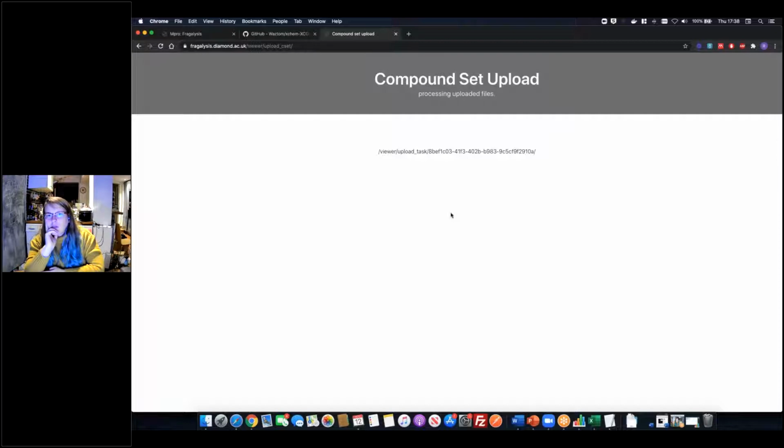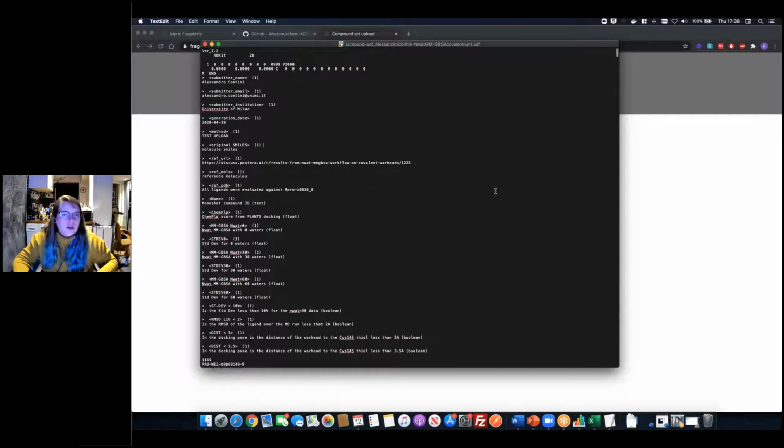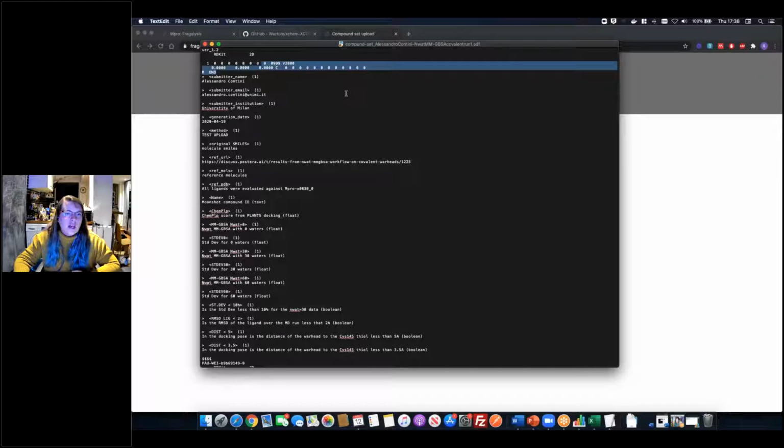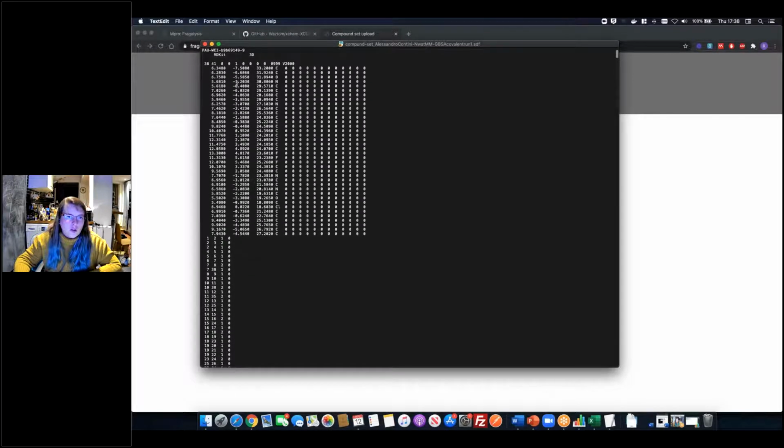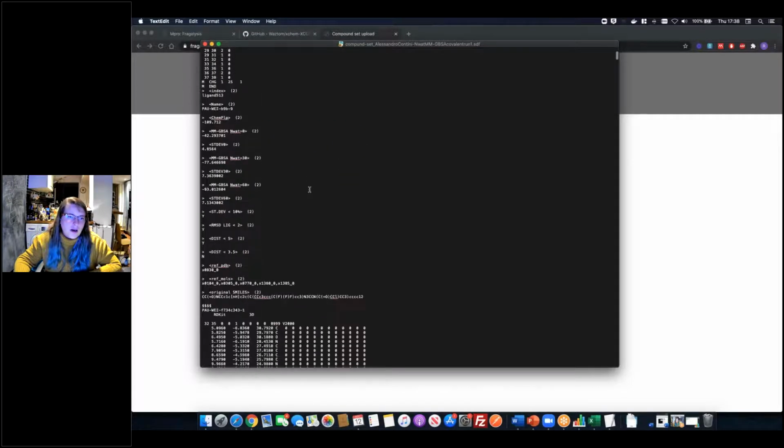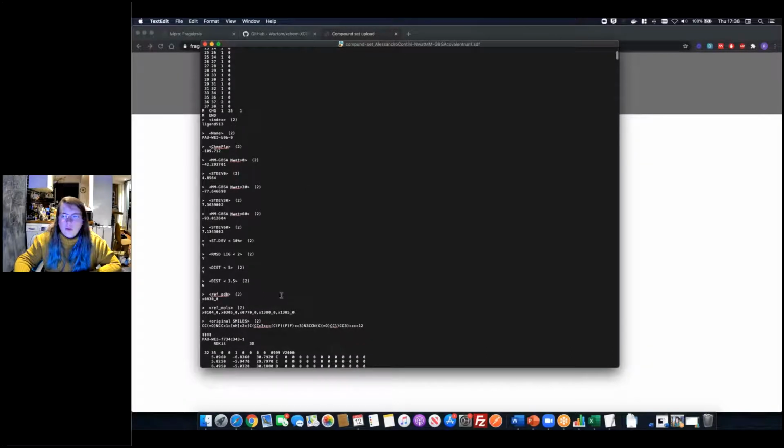Are there any more questions while this upload's happening, Chris? No, but I noticed the file you're uploading is a 2D file, is that correct? No, it's 3D. So that first, I can go through it. So the first molecule is just a blank molecule. So I think this has just been generated in RDKit by the person that's generated the file, and so it's just that initial molecule. But then if you go down and look at the rest of the molecules, they'll all be 3D structures with those values for the scores that we've defined in the reference molecule at the top.